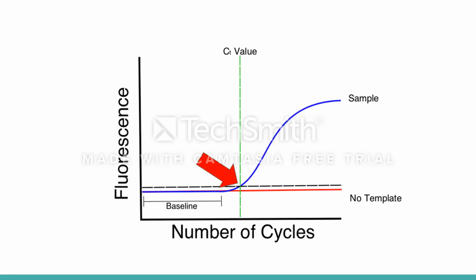So to explain this simply, the CT value is the quantitative point at which the thermocycler is detecting that there is more product being produced than background noise. Any real-time PCR run will have many of these curves from several samples, and therefore many CT values.